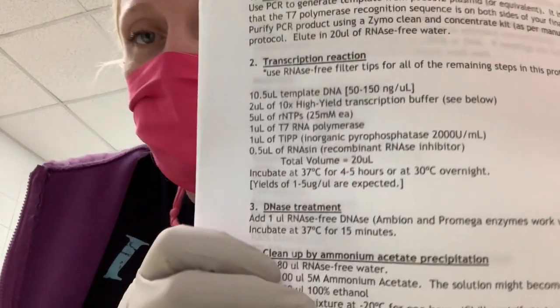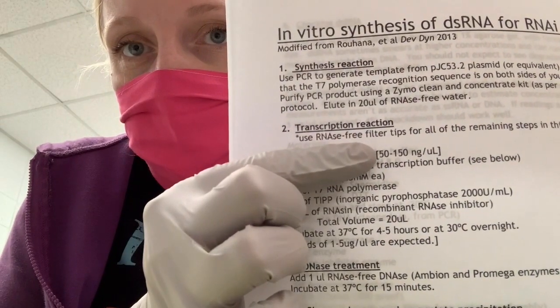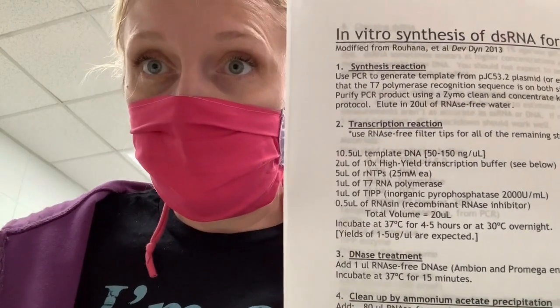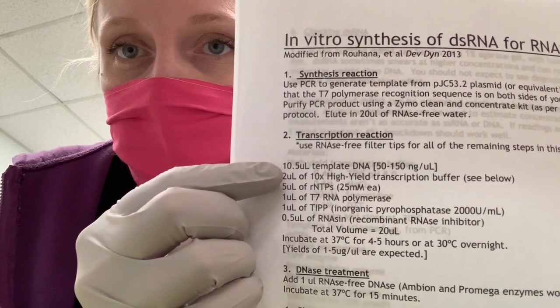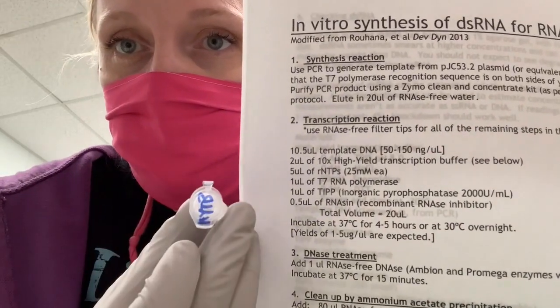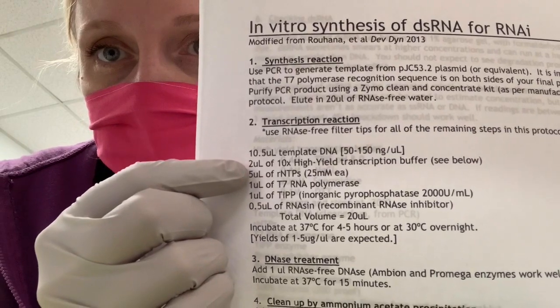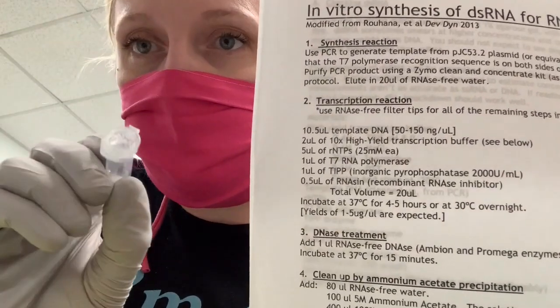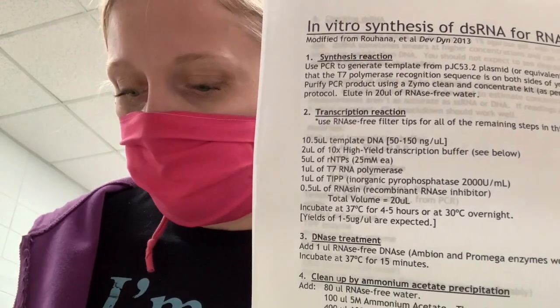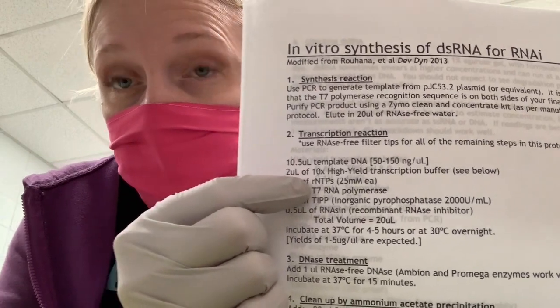And so this reaction is going to combine the template, which is our DNA. It needs to be between 50 and 150 nanograms per microliter, so you can check the concentration of those if you'd like. And then we're going to have high yield transcription buffer. We're going to have 25 millimolar rNTPs, so that's all of the NTPs you need to make RNA from DNA. We're going to use T7 RNA polymerase. It'll just say T7 on the lid.